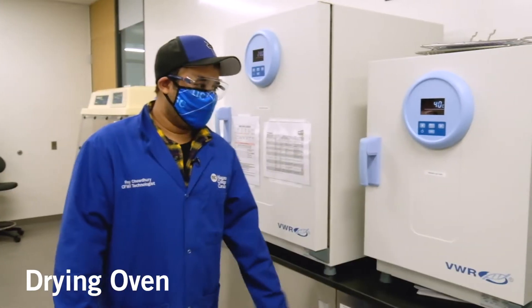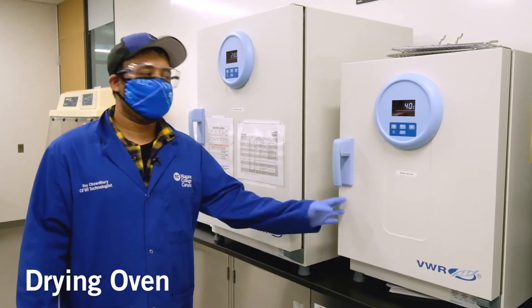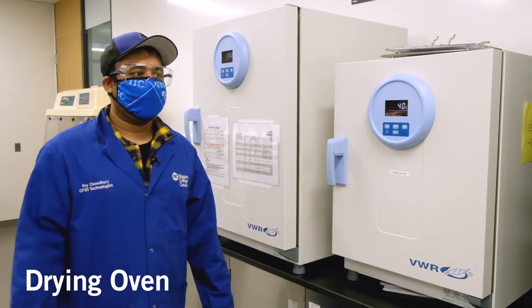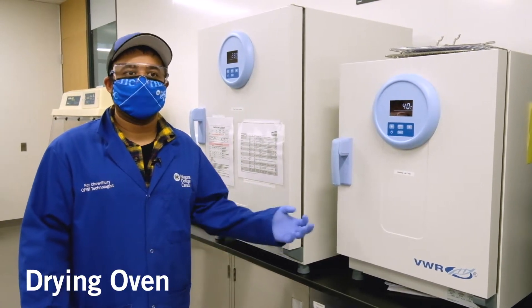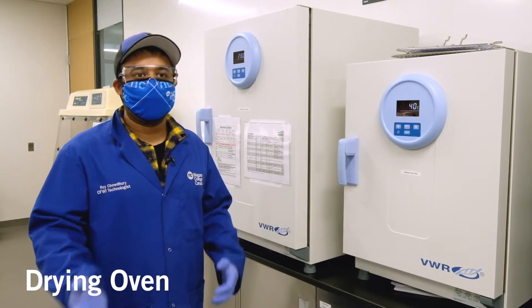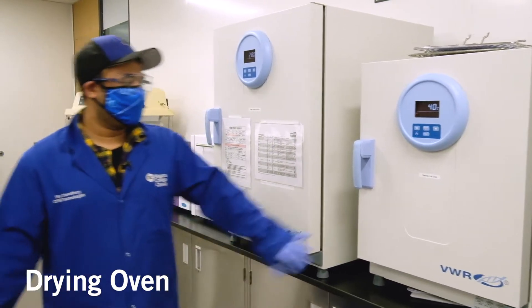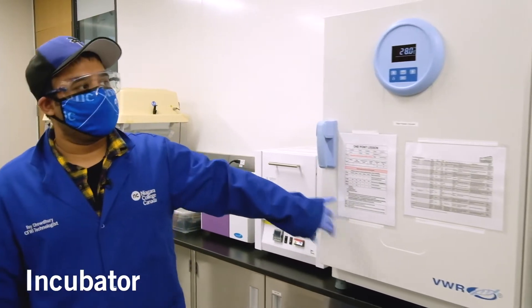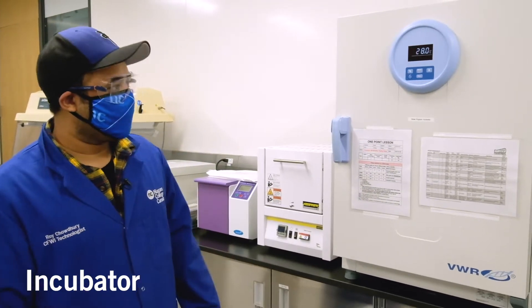This is the oven. Typically the food science students use this to dry their samples — basically to grab like their target compounds from different kinds of samples they're working on in their experiments. This is a general lab oven. This other unit is also an incubator and serves the same purpose as the one I described over there.